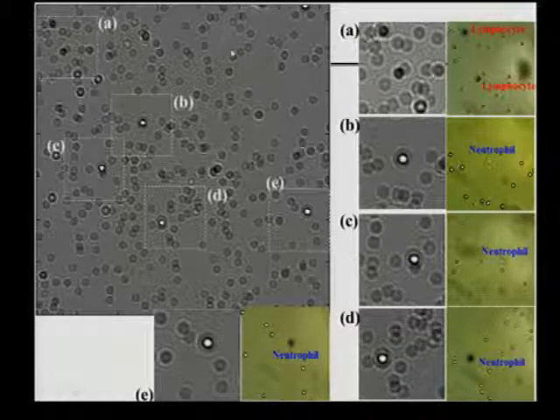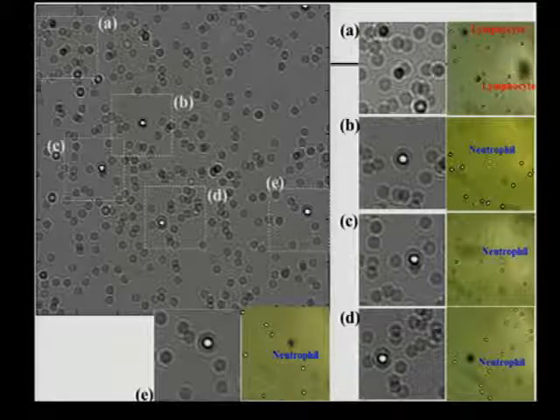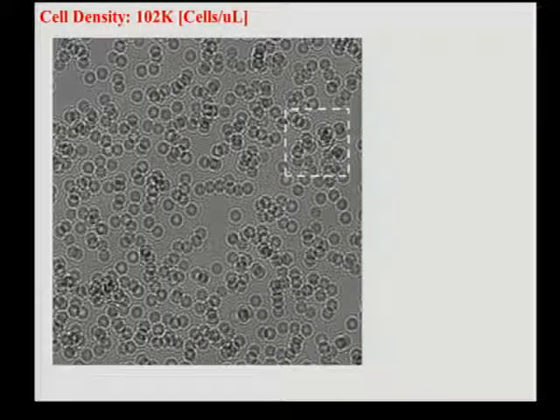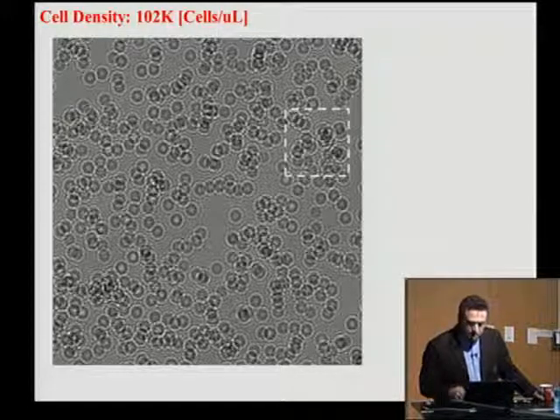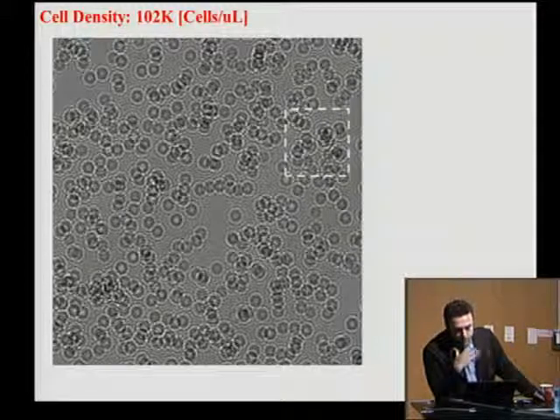These are red blood cell shadows, and these are white blood cell shadows. So in a simple mode, you can actually forget about the image and look at the diffraction pattern to recognize cells based on a library and do cytometric analysis without any, essentially, image reconstruction. But it's not just a cytometer, it's also an imaging cytometer in the sense that you can actually reconstruct these images, because these are holograms that are formed by diffraction of light or interference of the scattered light from an object with a background.